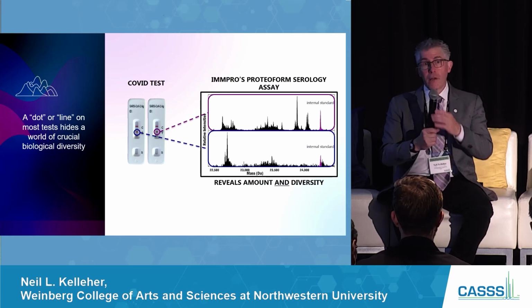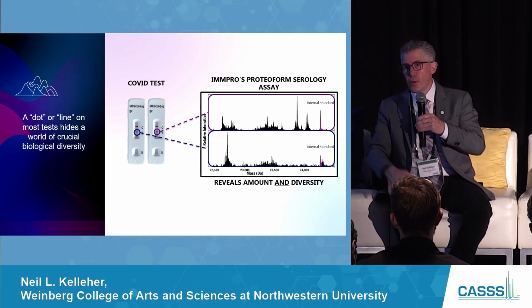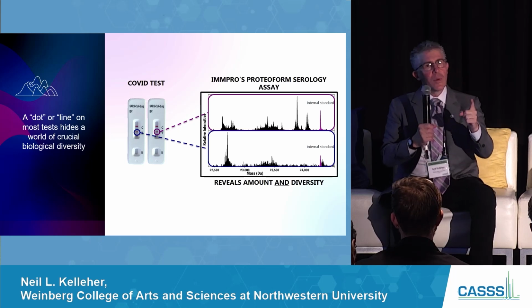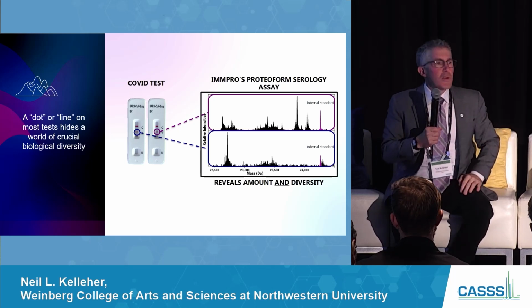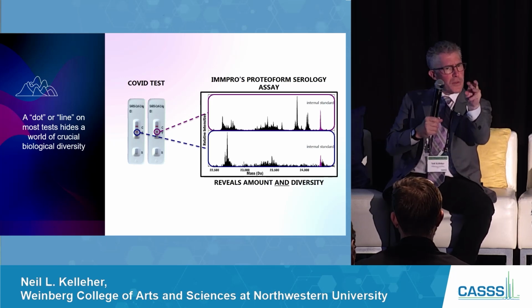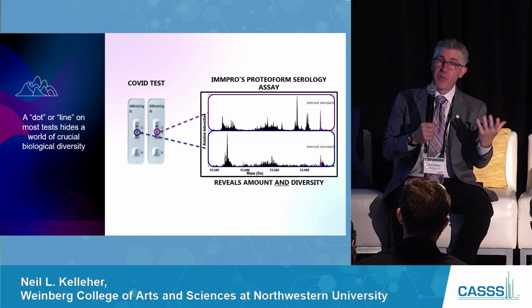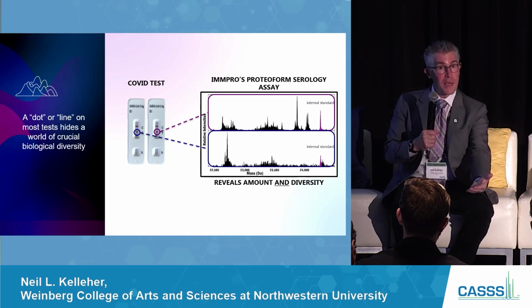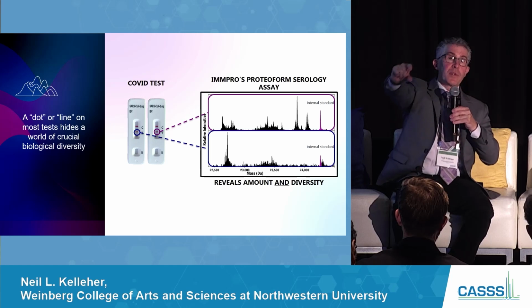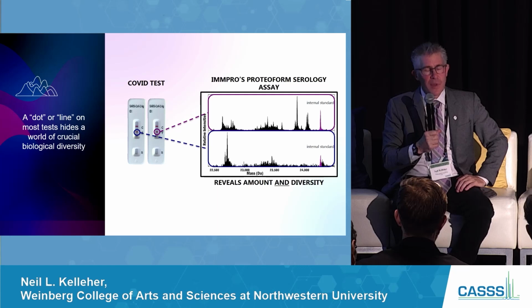We have just spent a year trying to get cytokine level detection. And as you know, the world's gone crazy with Olink, and we're getting cytokine profiles, but that's protein level, right? We know there's 8 proteoforms of interleukin-8. I remember that because there's 8 proteoforms. And there's cysteine modifying. There's forms of it swimming around. So if you had that knowledge, and we're about a tenfold off in our ability to detect IL-8 in plasma or serum. Maybe if someone's in a cytokine storm, we have enough to detect it. But we put a lot of effort into that, and we're still tenfold off.